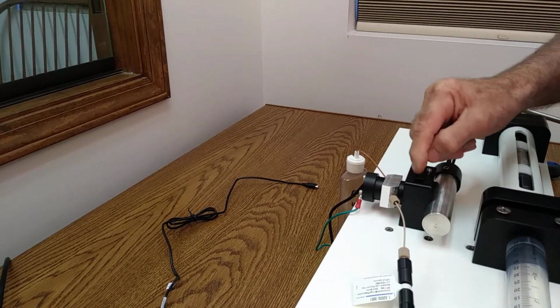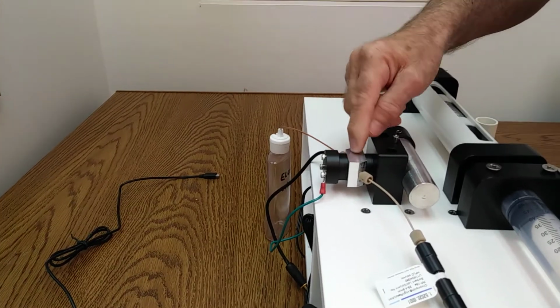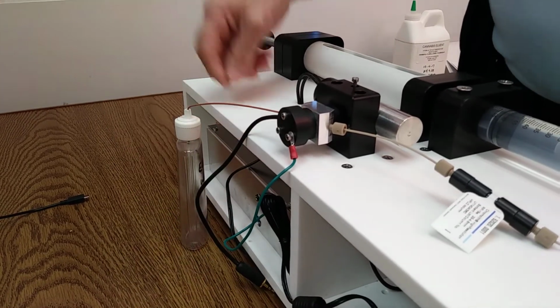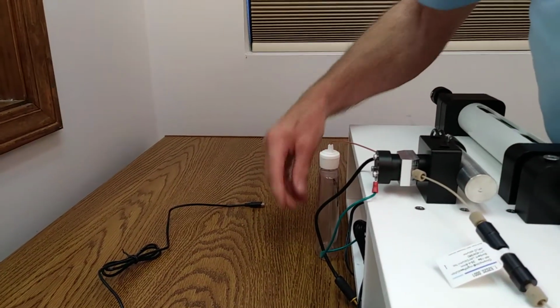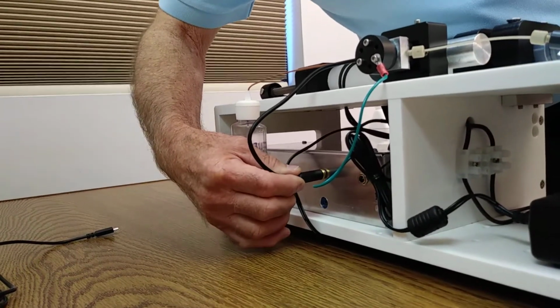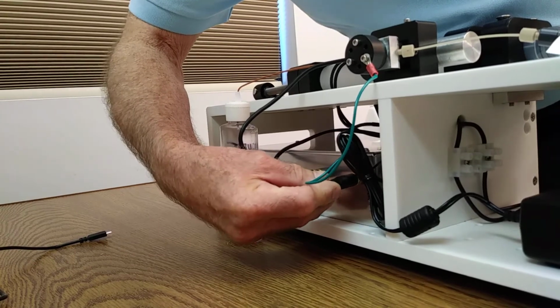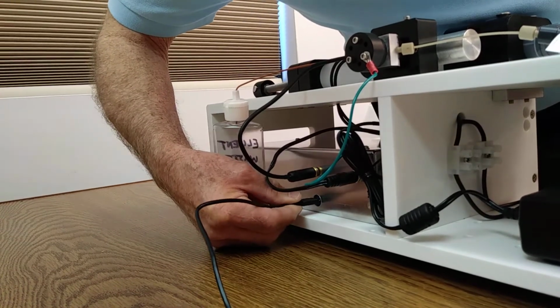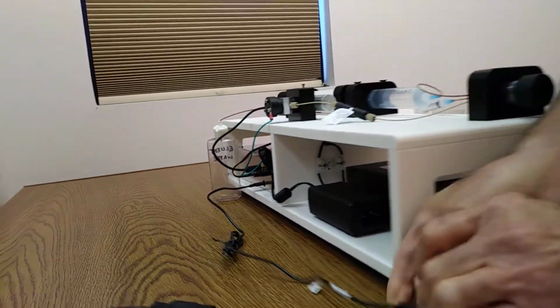It goes through a hole inside of this block, through the flow cell, which is a 1 centimeter path length, and back to the detector, which is back here, located inside of this block. The detector signal comes out and goes out to the electronics. There are some electrical connections we need to make, and while we're in the neighborhood, we'll go ahead and do those. So we connect the detector into here. We're going to connect the power supply. This is the power that powers the onboard computer here. And we're going to connect the USB cable here. The other end of the USB cable goes over to the computer.